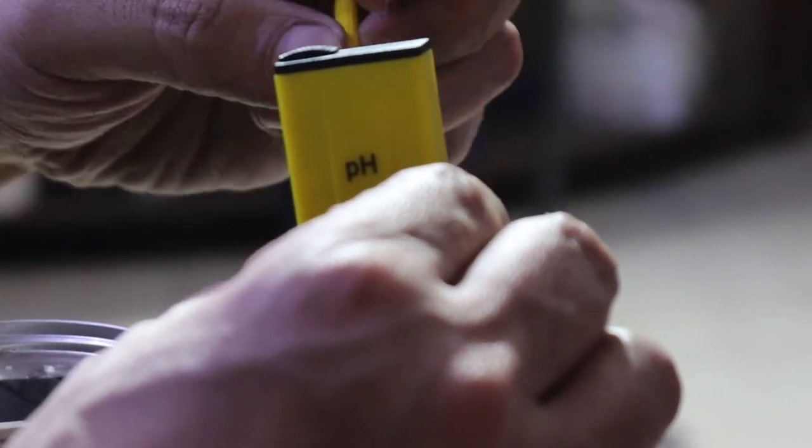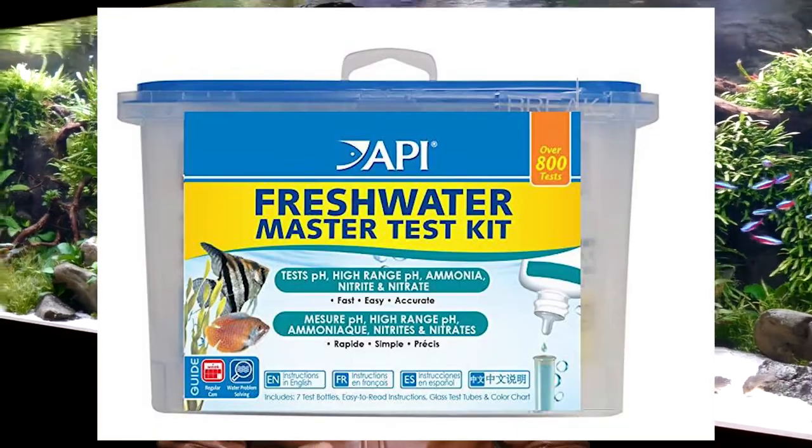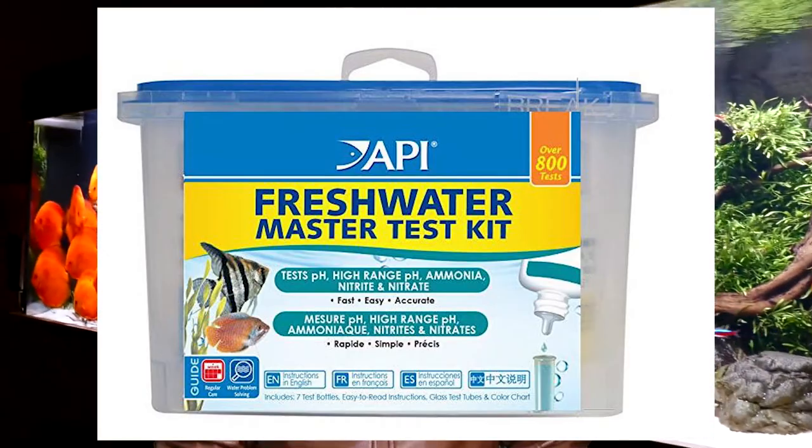You can check any aquarium water sample and check its reading. As a backup test, you should have a water test kit which also has a pH testing kit. If your reading from your water test kit is within plus or minus 0.3 of your meter reading, that means your meter is calibrated correctly.